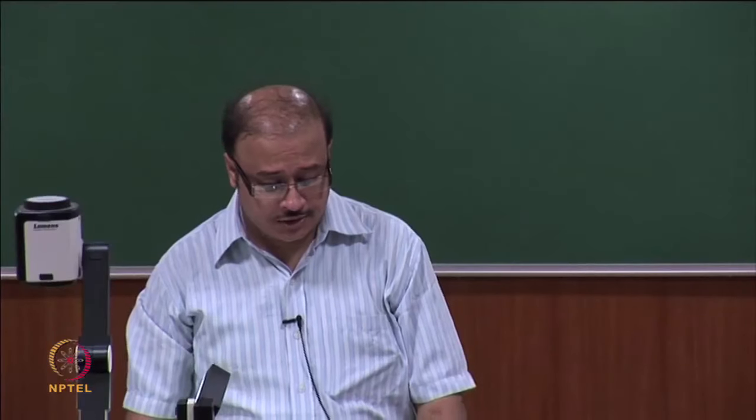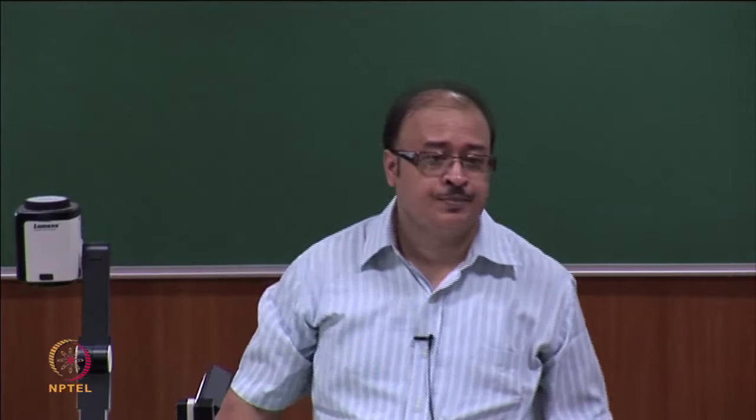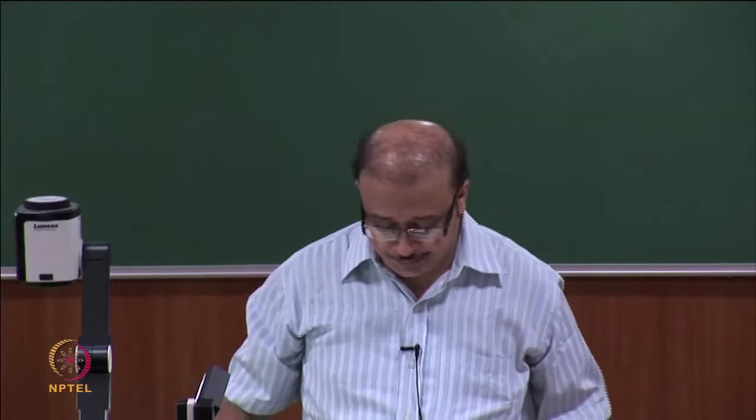We will start our class today. Last class, if you remember, we were discussing quenching of fluorescence and how it can be useful to figure out certain conformations of proteins, where the tryptophan is more exposed, where the tryptophan or any other chromophore is less exposed, right.